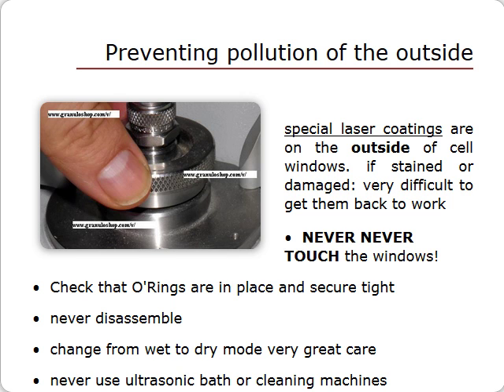Whenever you are putting the sample cell back in its location, make sure that the two o-rings are well in place and tightened firmly to waterproof the circulation circuit. If there is a leak, liquid will circulate and spill outside the cell, severely staining and damaging the outside windows. If such a leak ever occurs, the enclosure should be left open to dry for 24 hours, avoiding dust, as this area must be perfectly dry. Mist resulting from humidity may diffract light and add to the noise, and may also migrate to other optical components.